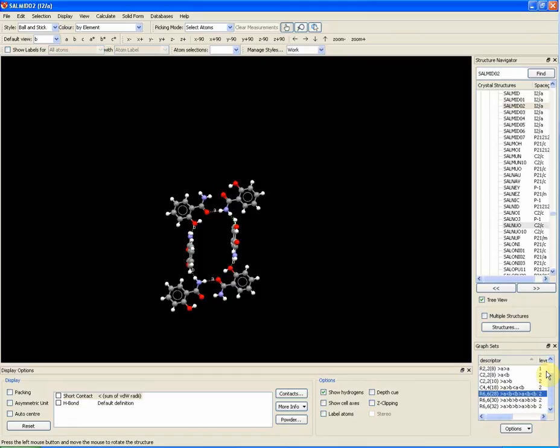If you hover over the code given to each graph set, then an explanation to what it fully means appears, like so.